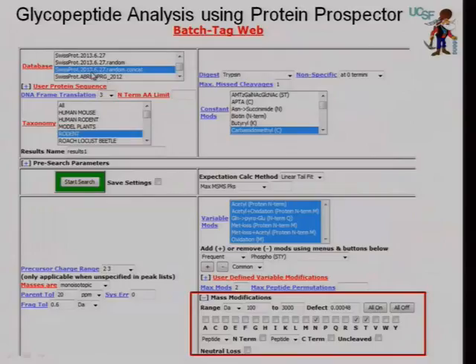So in the SwissProt database, which is a protein database, I told it only consider proteins that are rodent. This came from mouse. I could have told it only consider mouse sequences. I told it that this is a peptide that's been created by digestion with trypsin, and so on the basis of that, it can go through and calculate all the potential sequences of every single tryptic peptide from any rodent entry in this SwissProt database.